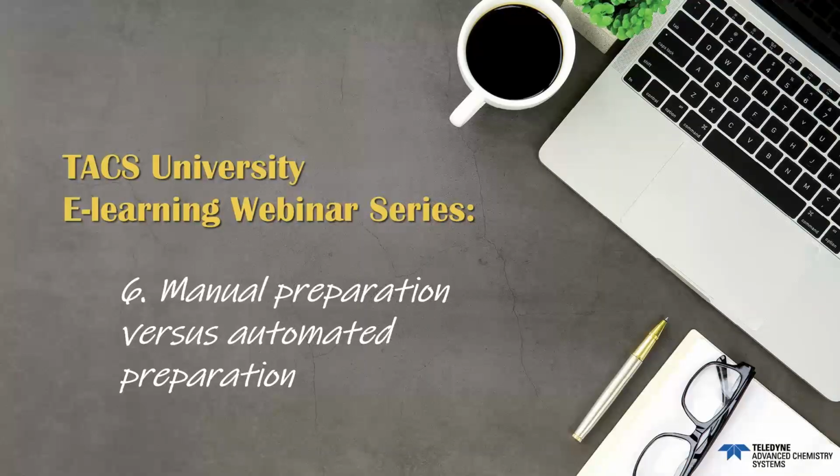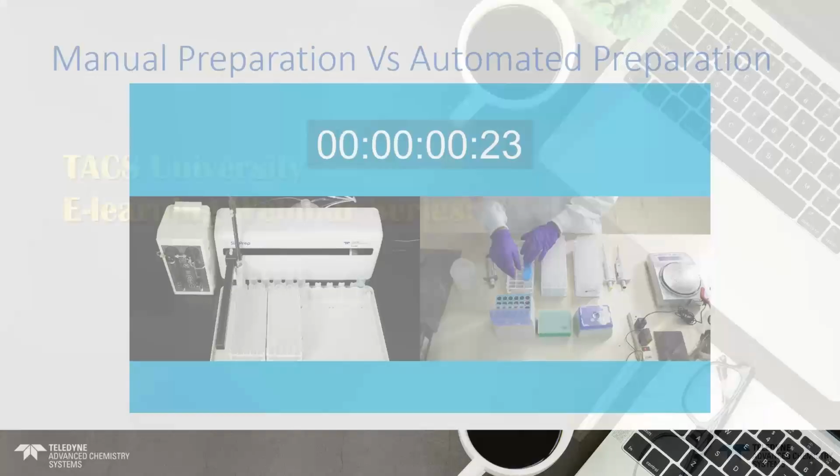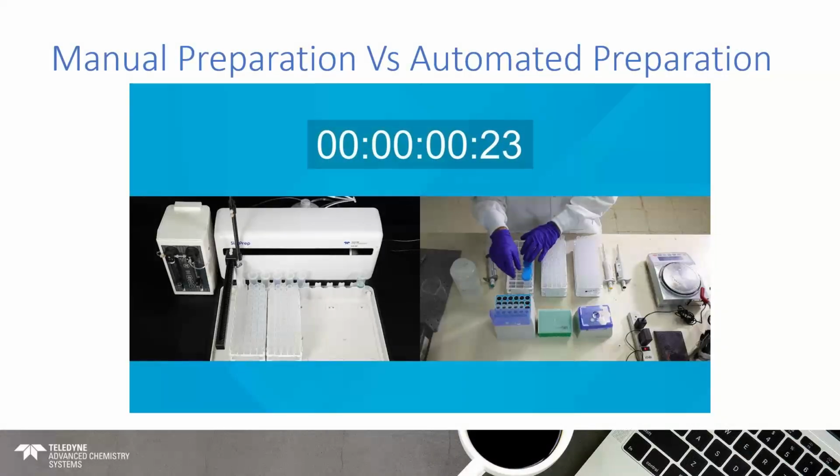So, manual preparation versus automated preparation. The video footage that you just saw was actually videoed quite recently, over the summer of this year. What I also did this year was put together some other video footage, doing a comparison between manual preparation and automated preparation. The point I want to make is that you'll see something quite simple: a series of standards that were prepared, and then a full rack of samples that were subject to, say, a 1 in 10 dilution.